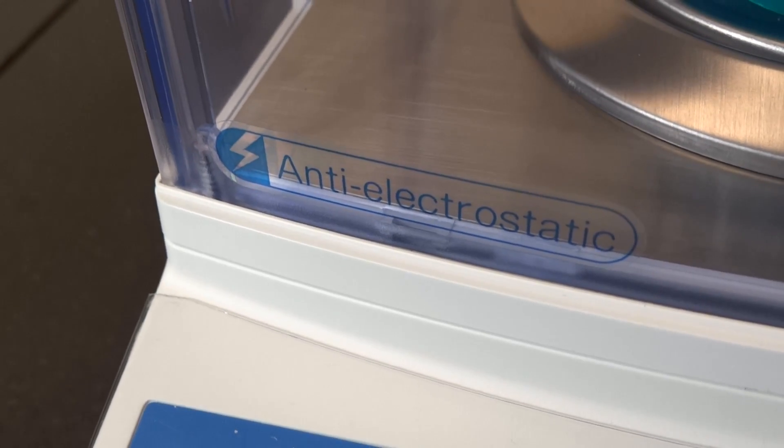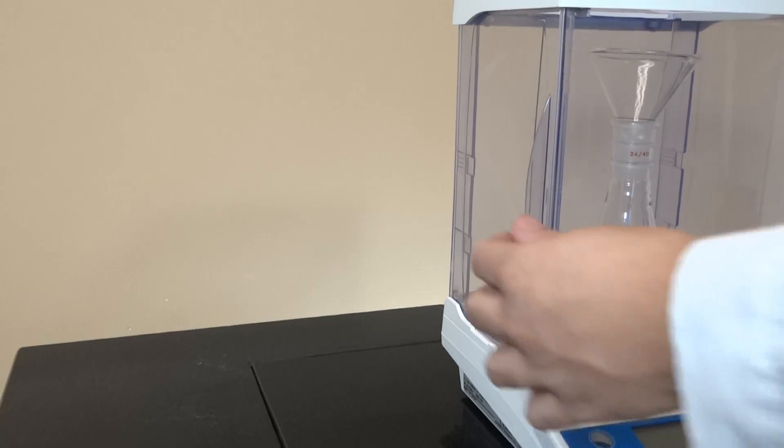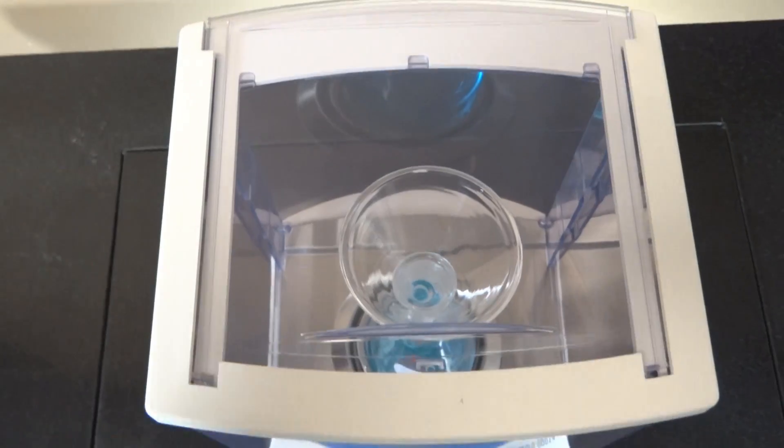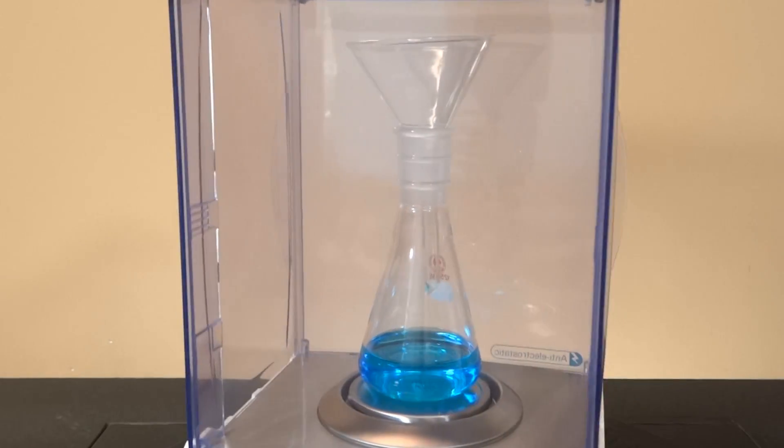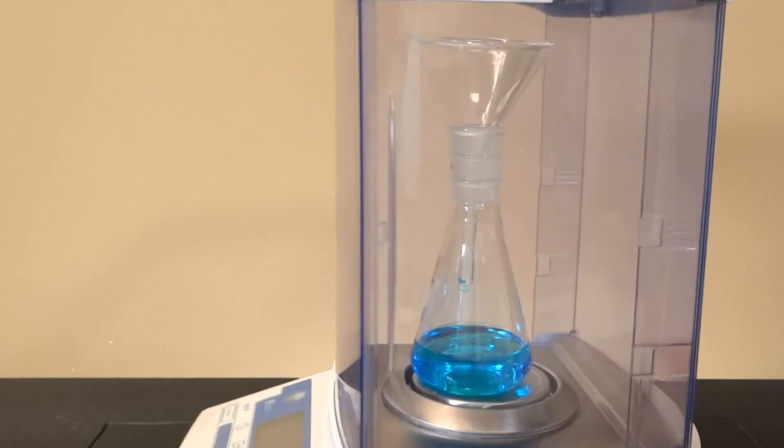The HT has three anti-static draft shield doors. The weighing chamber allows viewing from all four sides and from the top.